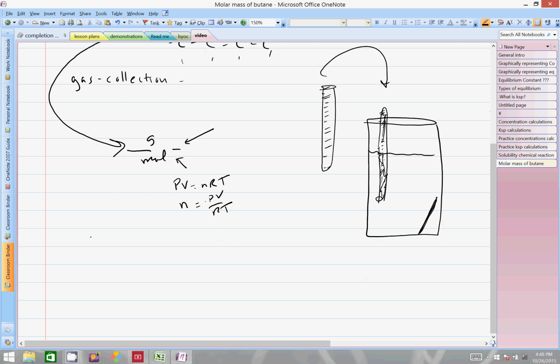Now the lighter, as of right now, and I may get different ones I guess, but here's the lighter, and it has a long tube. This tube here is a tube that would normally belong to a stick lighter. So it has the tank here, and then the handle here, and then the stick runs out and lights a flame here. So that tube runs up the end here.